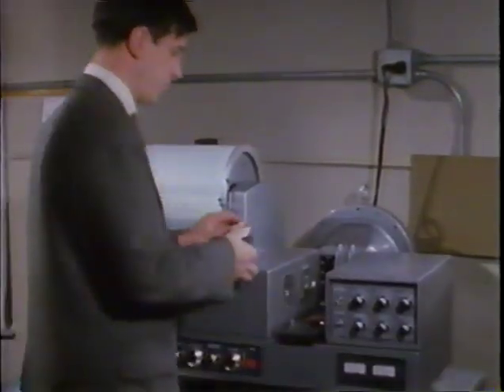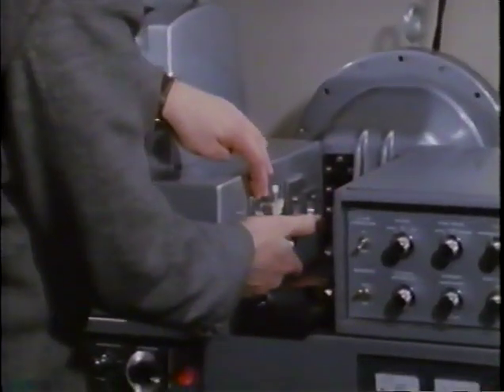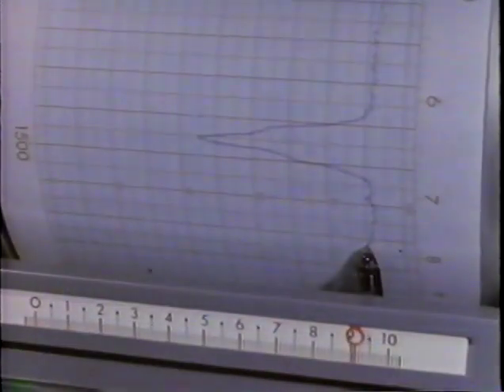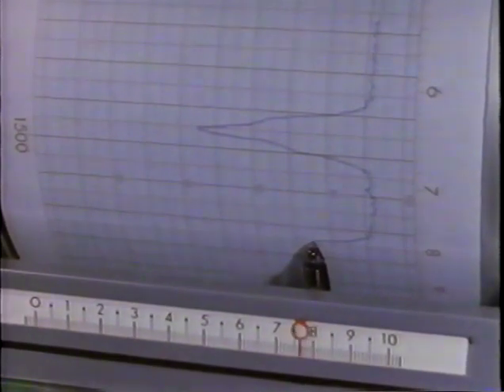The spectrum of the mixture will show not only the characteristic features of the predominant carbon tetrachloride, but also those of chloroform. The intensity of the latter is dependent on the extent of the contamination.